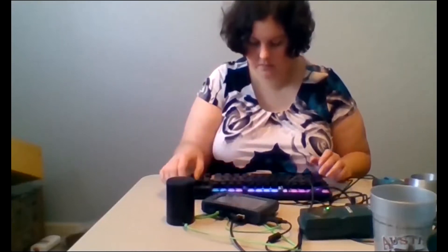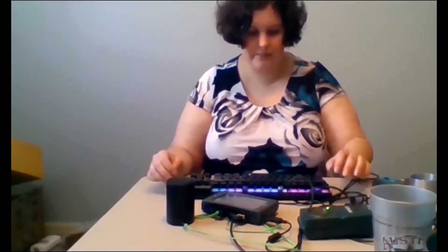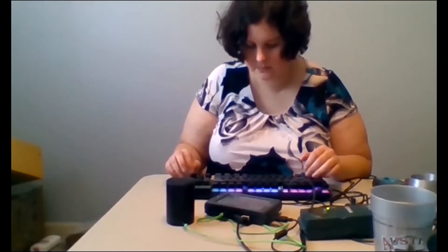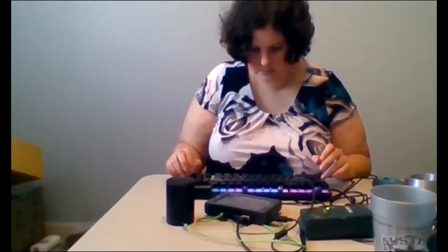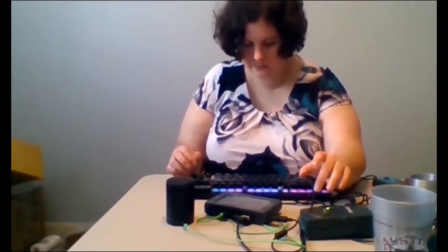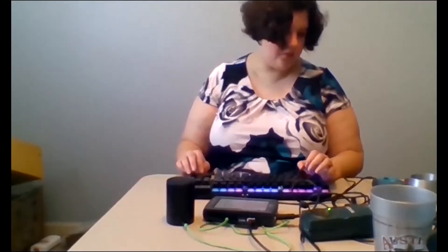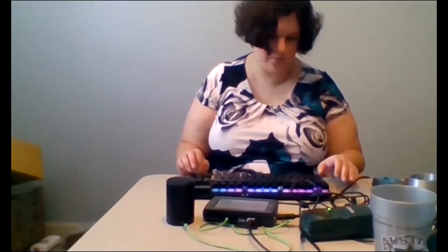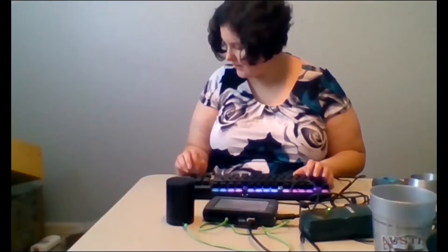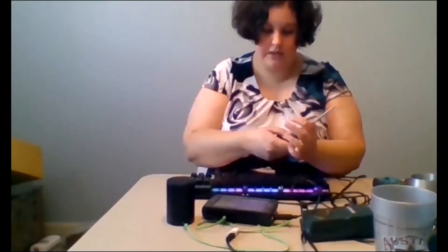Right now we have our Talking LabQuest running. I'm going to start a new file so I can open it up. When a sensor is attached, it will read off different selections on the Talking LabQuest. I'm going to hook up another sensor so that we have a new one to work with.